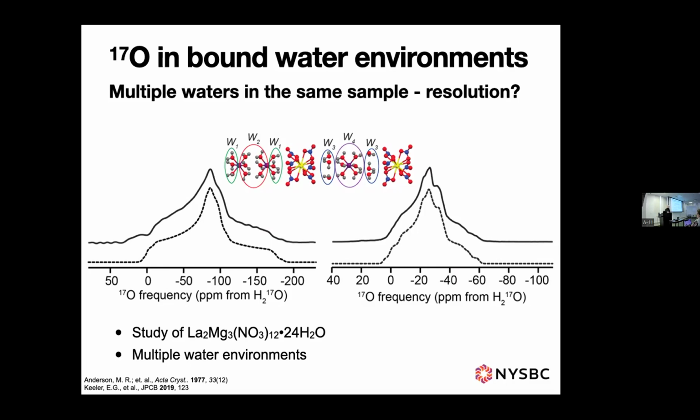One big issue with these is that everything I've shown you here, we're operating with labeled samples. These are not natural abundance oxygen 17 spectra. These are labeled for most of the amino acids, around 30% labeling. This is achieved using acid catalyzed exchange. So you put oxygen 17 labeled water and amino acid with concentrated acid and you let it exchange, and then you isolate out the amino acids and they've exchanged with the O17s.